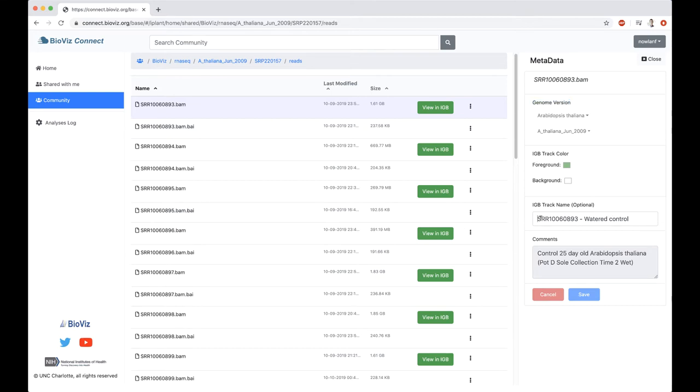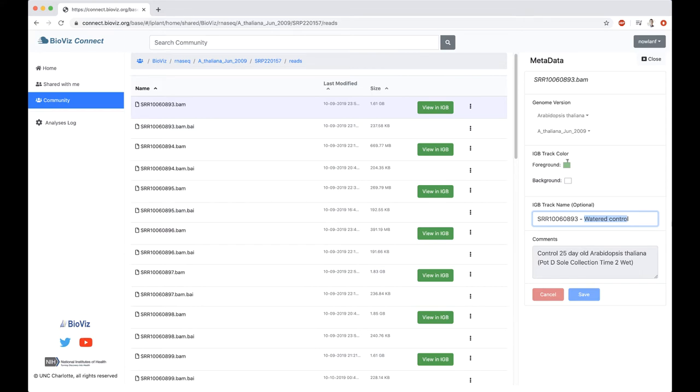For instance, we can see that the genome version is Arabidopsis thaliana, and it was aligned to the A. thaliana June 2009 genome. A lot of the metadata that we're showing here is curated specifically for what we think is helpful for visualizing this data within the integrated genome browser. The genome version mirrors genome versions that are available within IGBE. Track color will be how this data appears within IGBE, as well as the track name. Here we've got the SRR, the name of the file, and it's a water control. This is a 25-day-old Arabidopsis thaliana control sample, as well as some additional information.